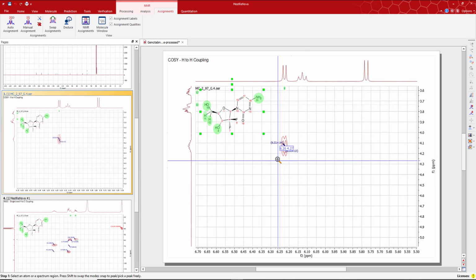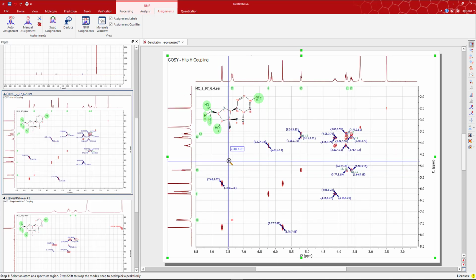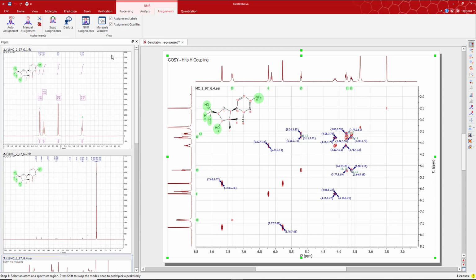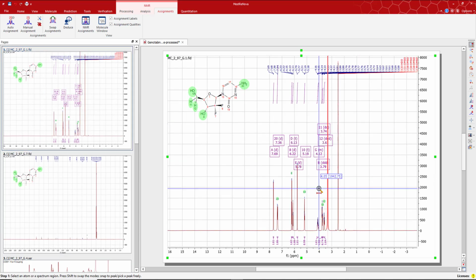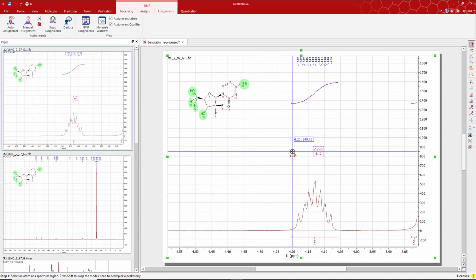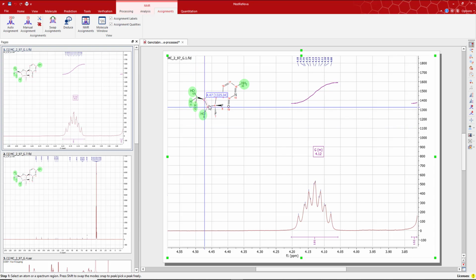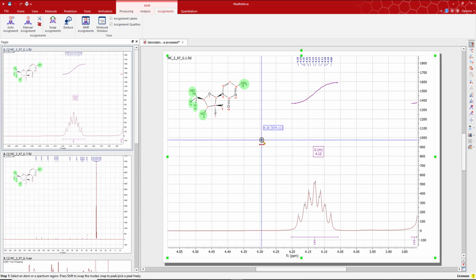And we can see that there is a cross peak right here with this proton at about 4.1 ppm. It looks to be a fairly complex kind of multiplet, so let's go to the proton and take a closer look specifically at that peak. So it's this thing right here. And Nova's called that a multiplet, and if you're wondering, well, that's just a 1H with two neighbors. It's got a neighbor here and then a neighbor on oxygen. Why is it so complex?